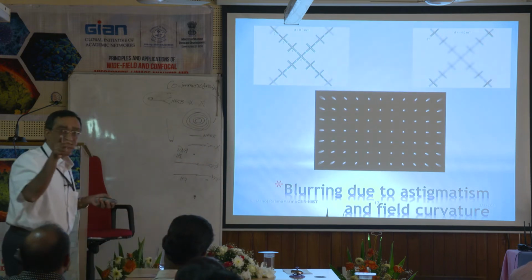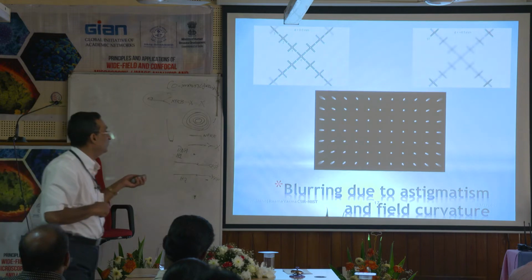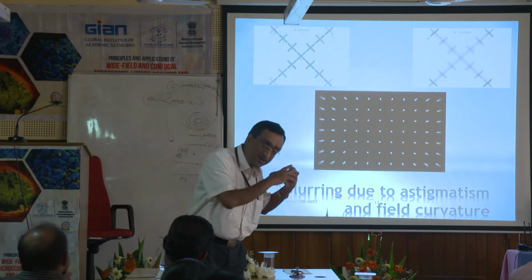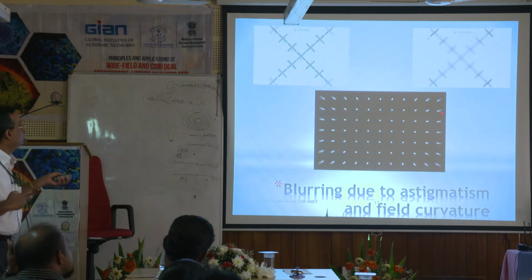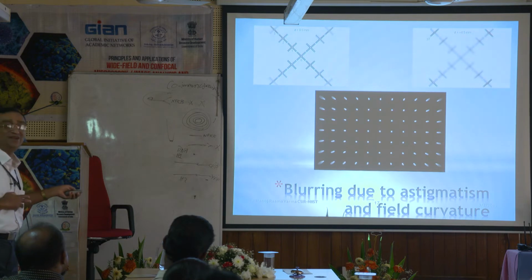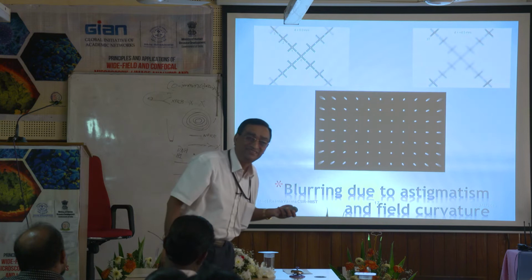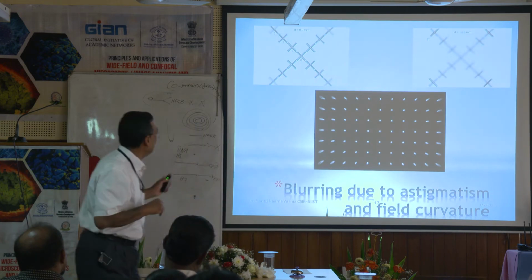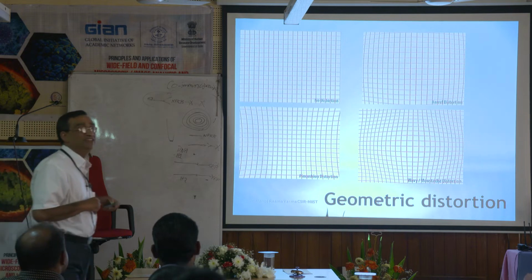And I told you about the curvature effect. Look at this field curvature effect: a series of illuminated spots viewed through the microscope. These are all elongated, whereas the center remains as such. This is because of the field curvature effect. Clear? And this is the geometric distortions.